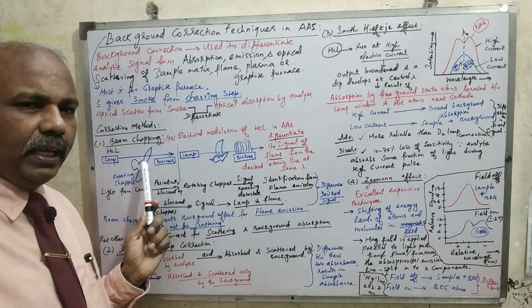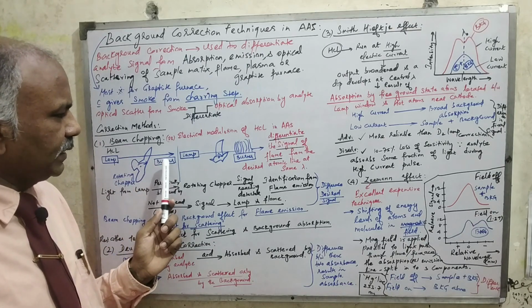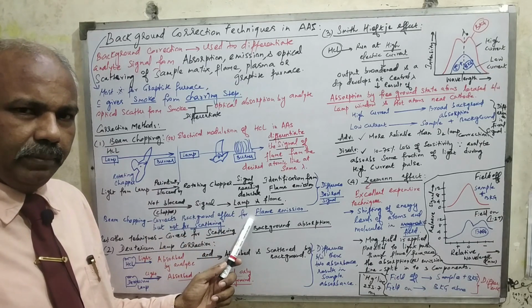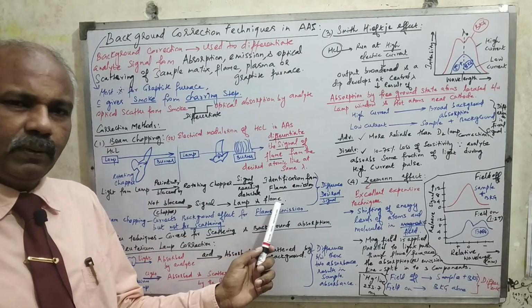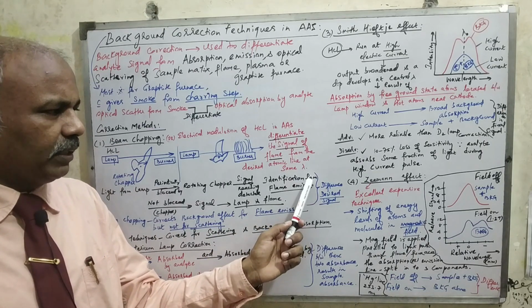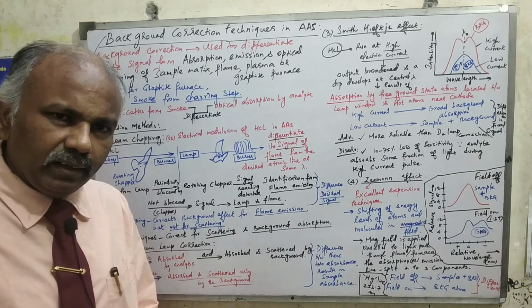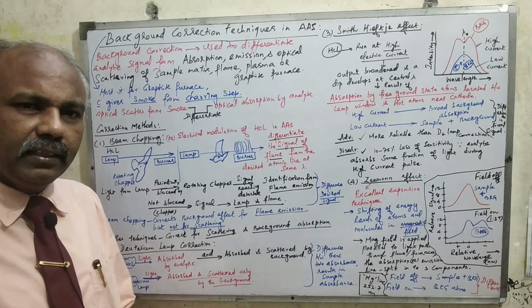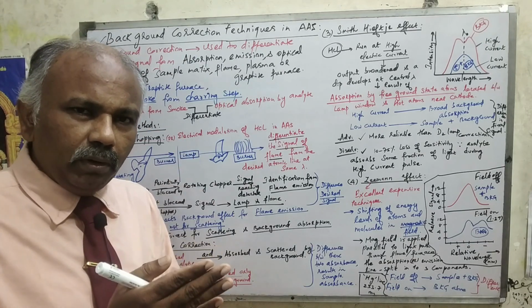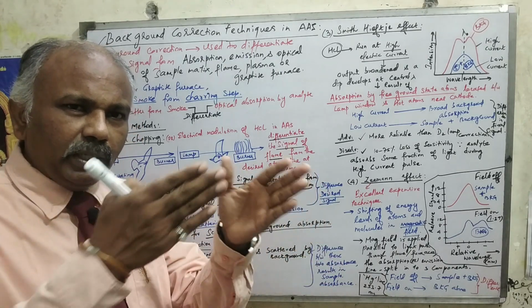Whereas if you are not blocking with the rotating chopper, as in the first case, the signal will be due to both the flame and the lamp. It is a combination of both. So if you take the difference between these two signals, that will give the original analyte signal. Is it clear? This is how we make the difference, because I told you already about the flame profile, when the flame comes with outer combustion, the flame always catches fire by drawing outside atmospheric air into the flame.